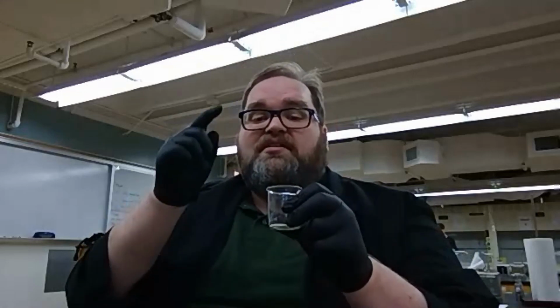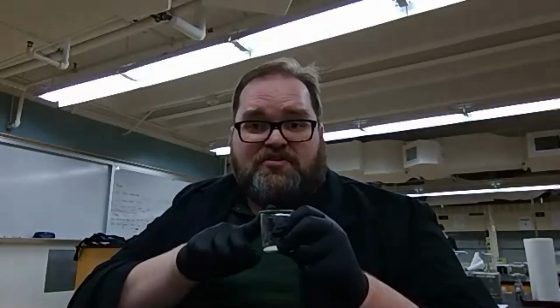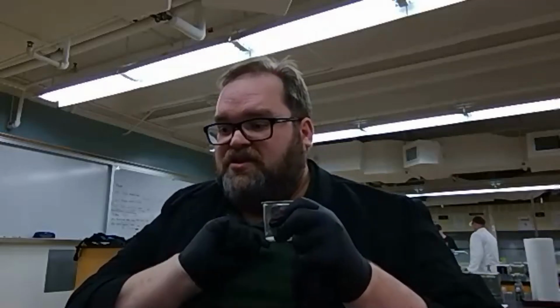So what we're going to do is I have taken this beaker and I have obtained its mass, and then I have put a sample of our salt and sand mixture in it, and I have obtained the mass of the mixture plus the beaker. The mass of the mixture in the beaker minus the mass of the beaker will give you the mass of the mixture, the original mixture.